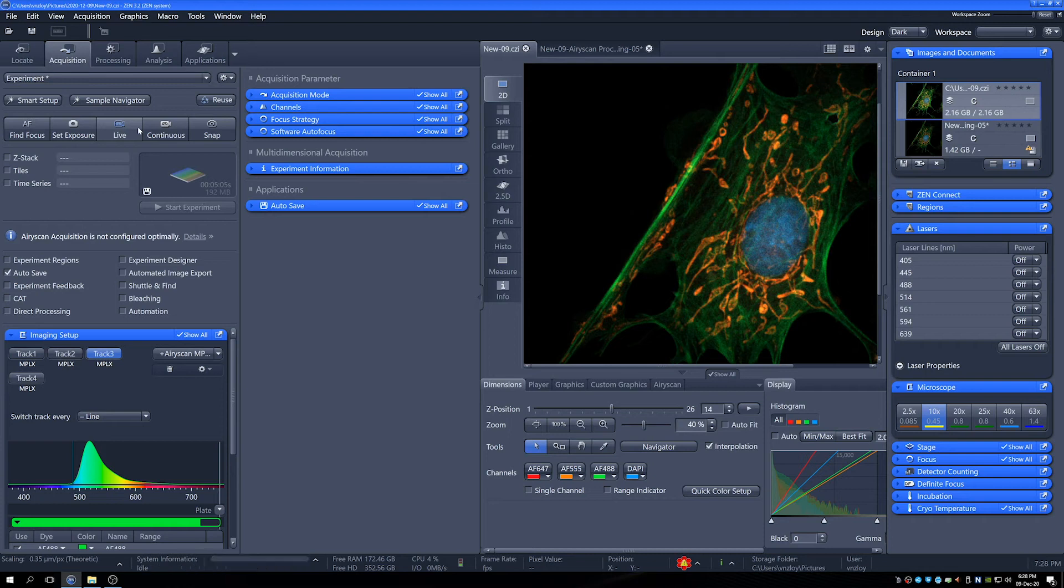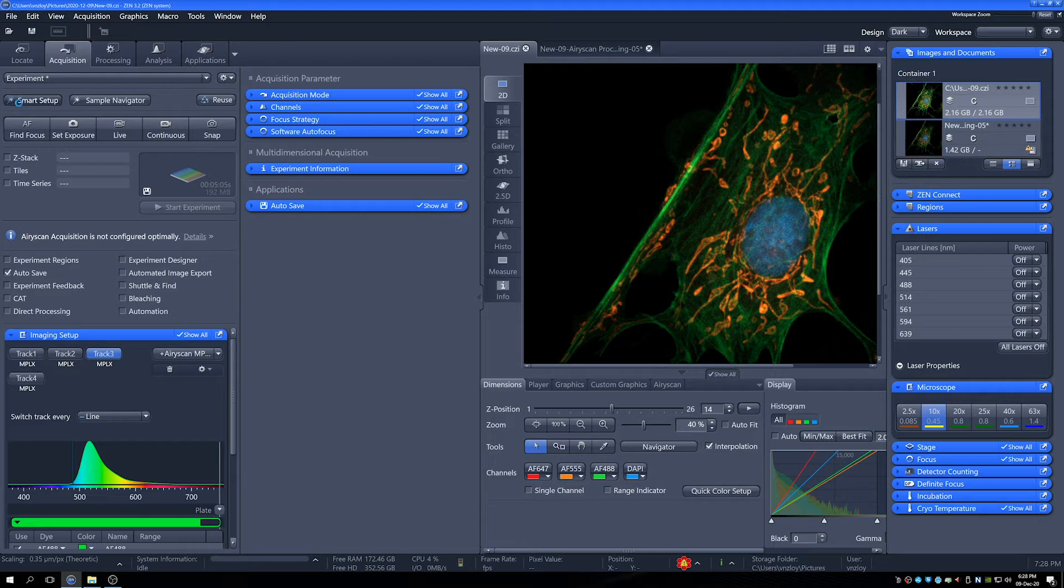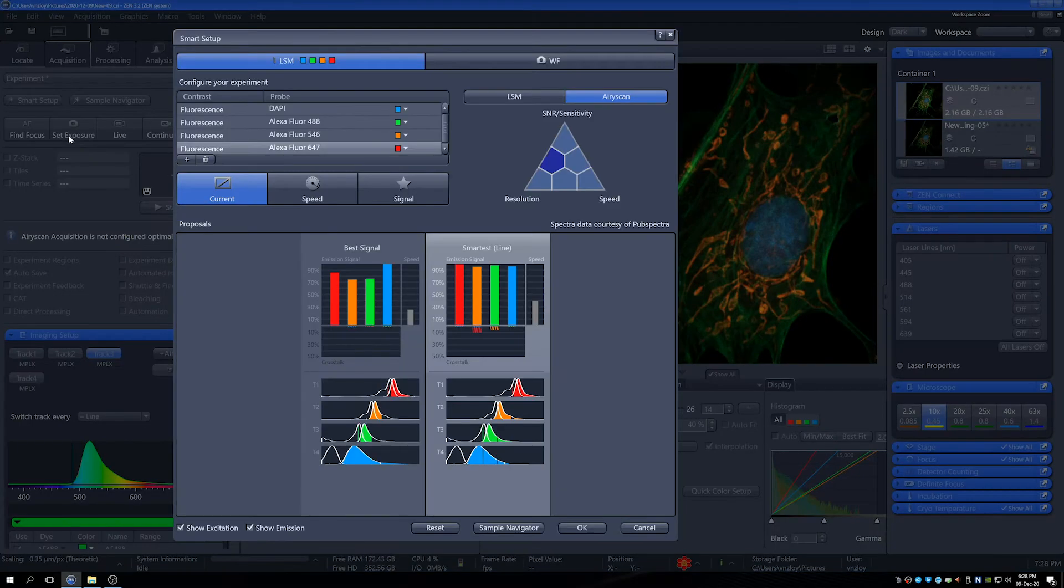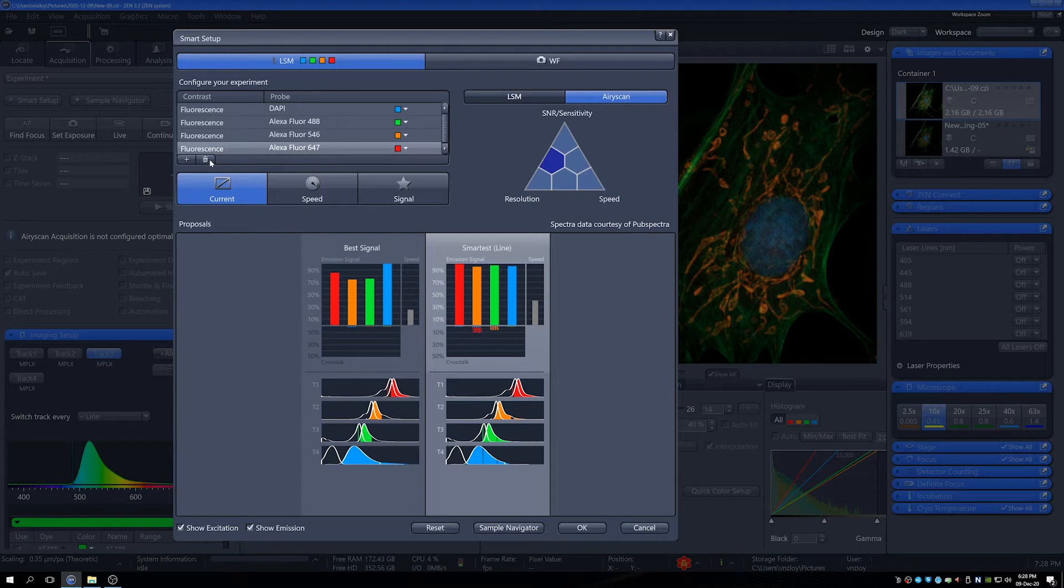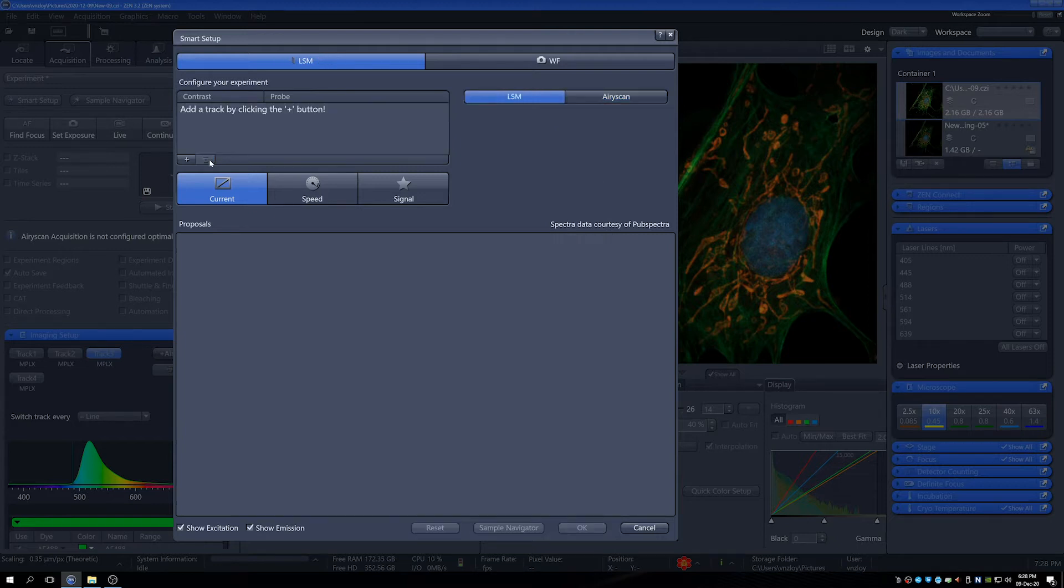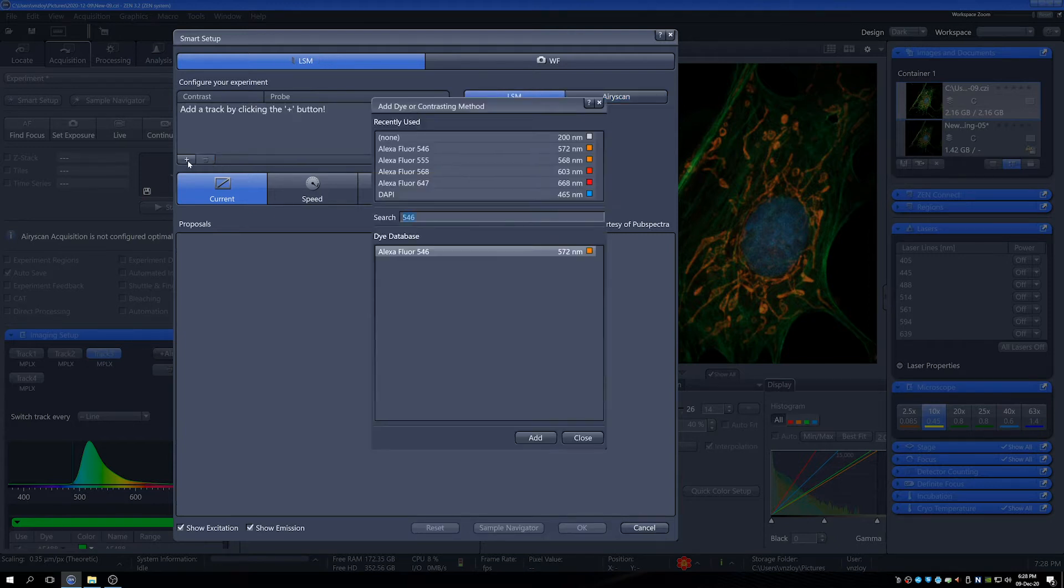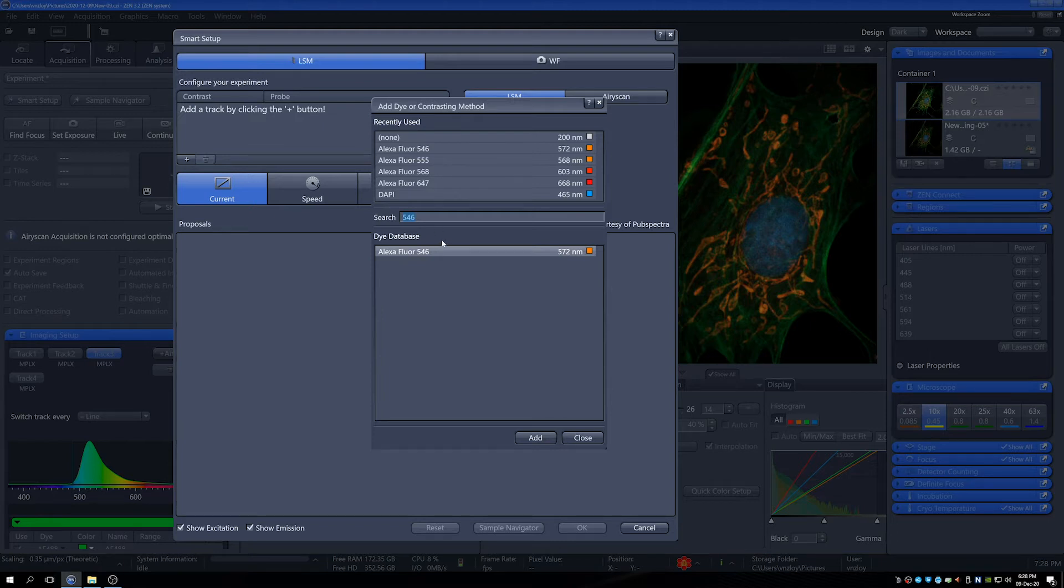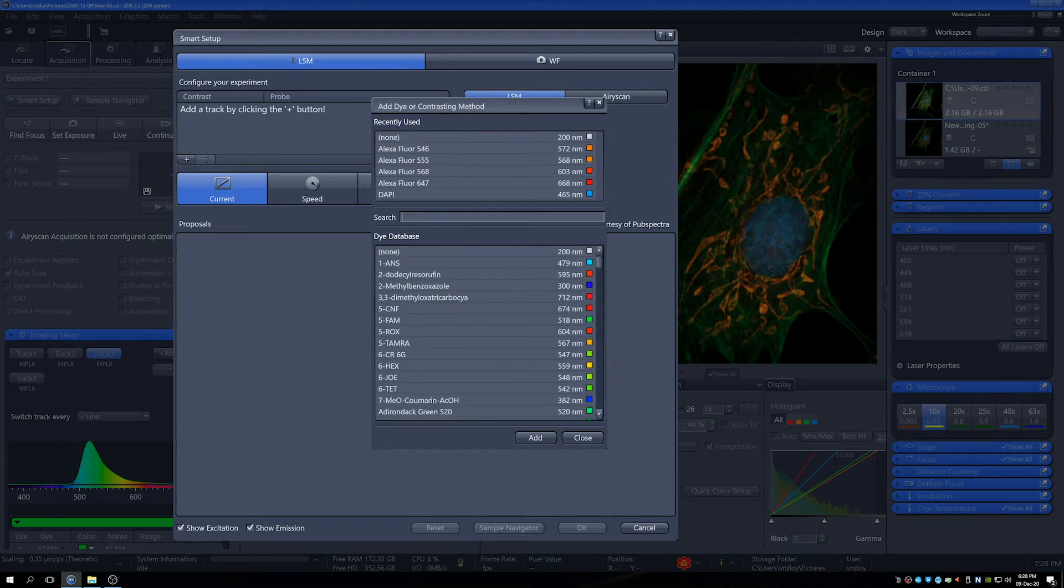The easiest way to get going on these kinds of systems is to use Smart Setup. This is useful for both ErieScan and for LSMs. If I just go into here and remove what I was previously looking at, clean that up and go into Add Channels here.